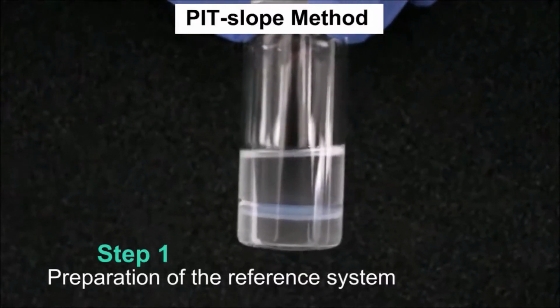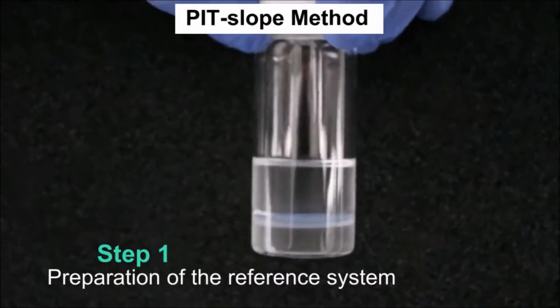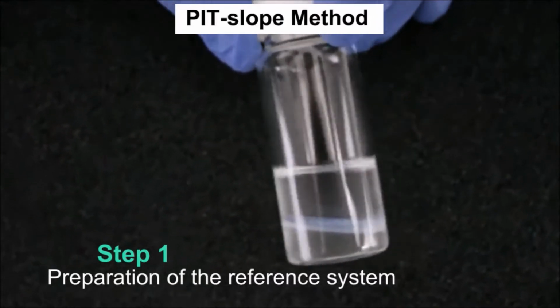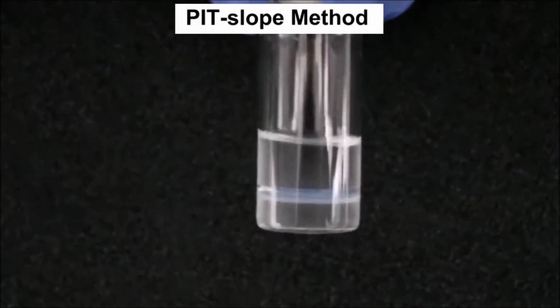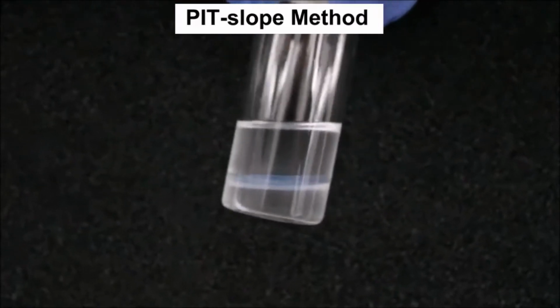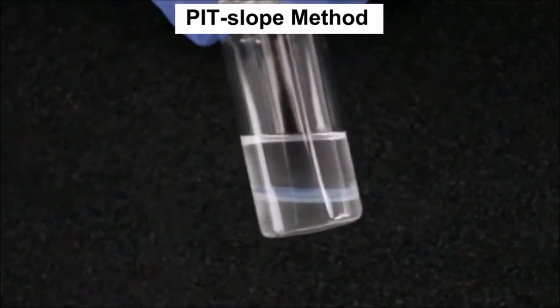At room temperature, this system presents a three-phase behavior, an equilibrium between the aqueous phase, a microemulsion with most of the surfactant, and the oily phase. This system was chosen because its phase inversion temperature is very close to room temperature.